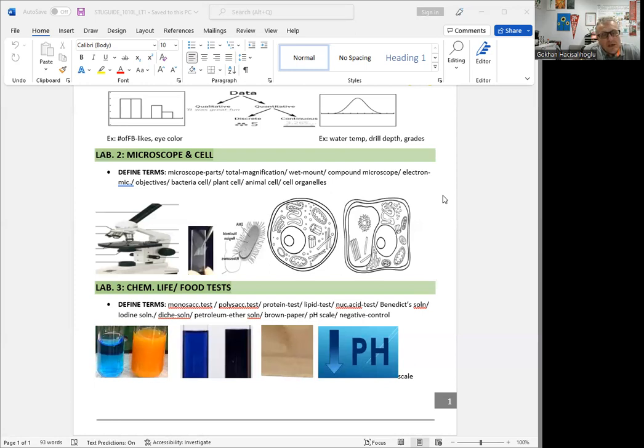And pH always goes from 1 to 14, and 7 is neutral. We use pH paper or a pH meter to measure and assess the pH levels. If you're just interested in whether it is basic or acidic, we can also look at color changes like blue or pink, and we can test different food items for their pH. So make sure you know the assay types, the pH scale, acidic and basic, and the color changes, which each of them gives as a positive response.